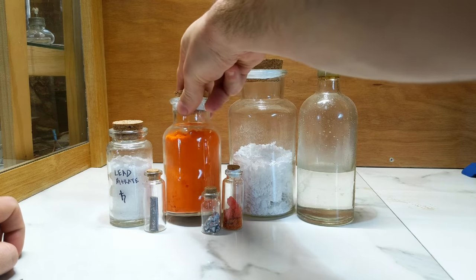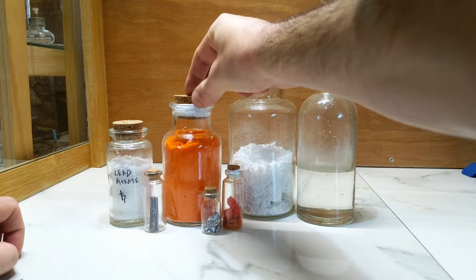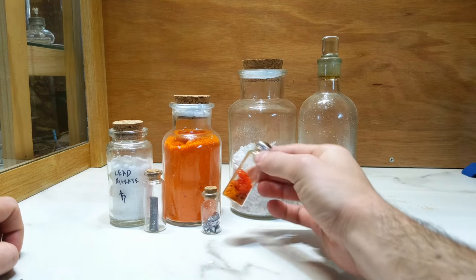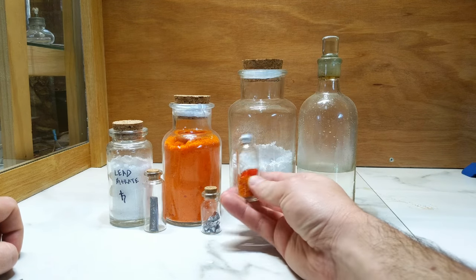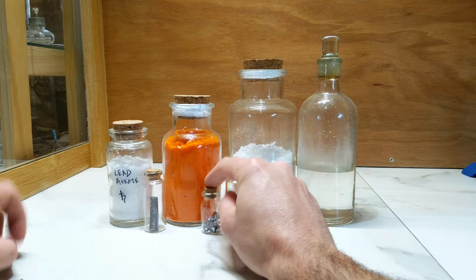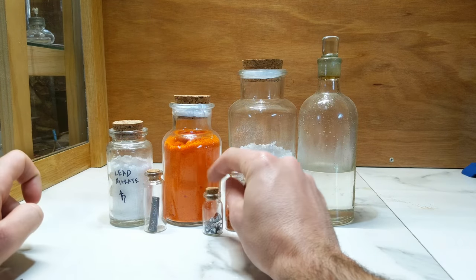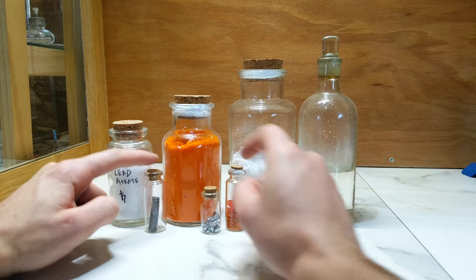So here we have the large jar, this is potassium dichromate. Here we have a small sample of crystals of ammonium dichromate, and here in the jars we have our samples of chromium, elemental chromium and lead.